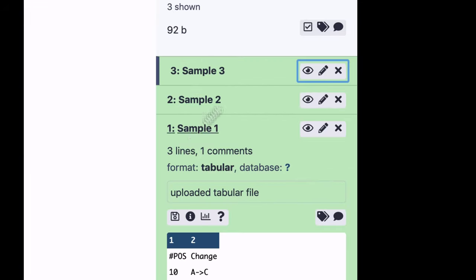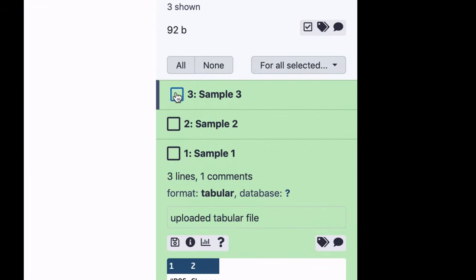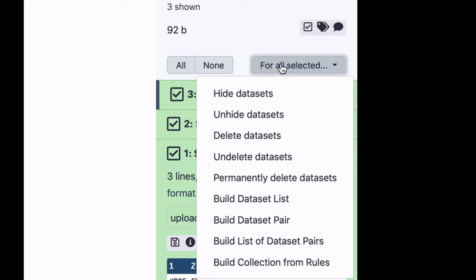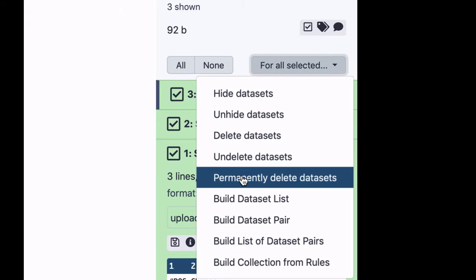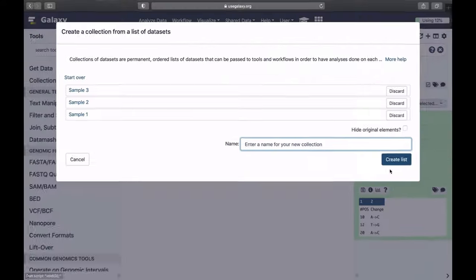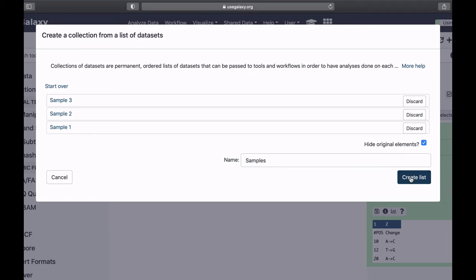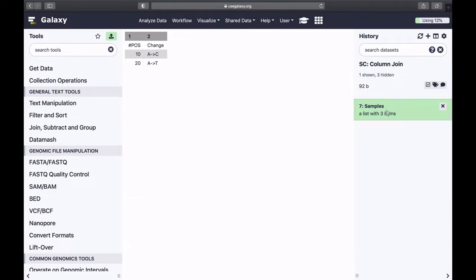First of all, I'm going to create a list out of these datasets. So I'm just going to select them all, and for all selected, build dataset list. I will call this list samples, for example, and I will hide original elements. So here is my list.